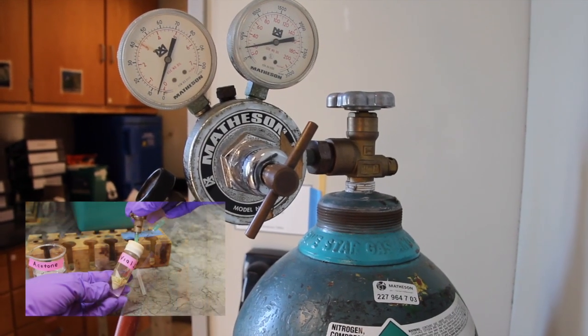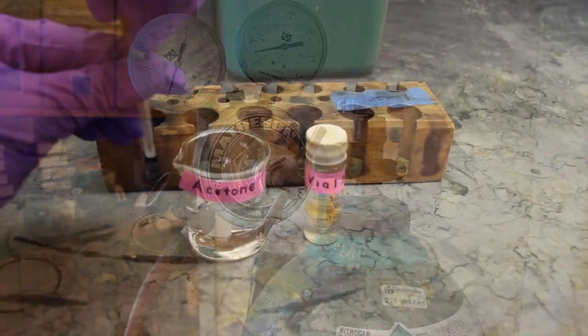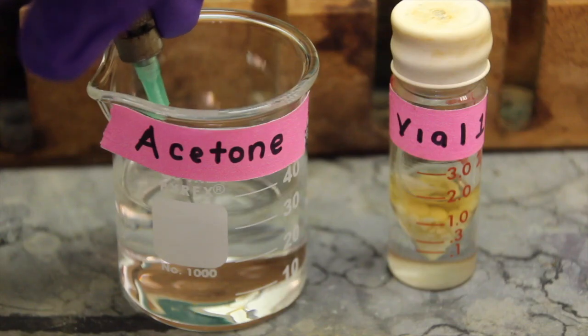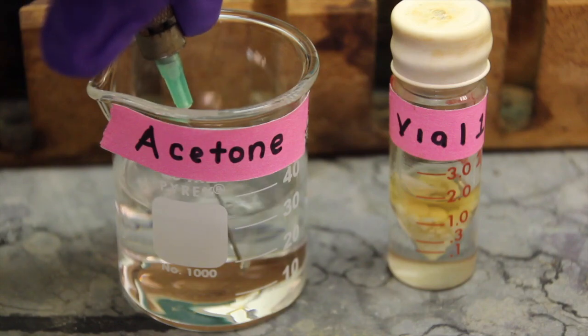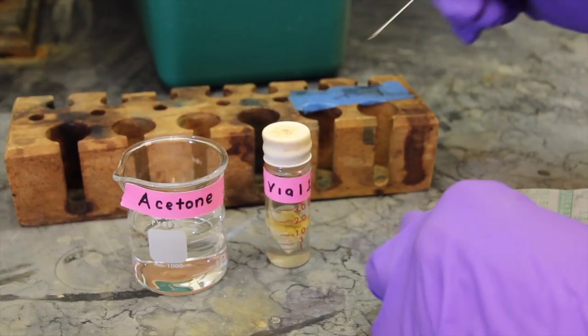Next, flush and sparge the vial with nitrogen for one minute. The gas lines will be prepared for you in the hood. You can confirm the gentle flow rate and check that the needle is not clogged by placing a needle from the gas line into a beaker of acetone. The gas line should generate a continuous stream of small bubbles in the acetone.